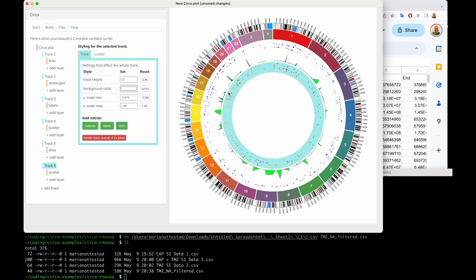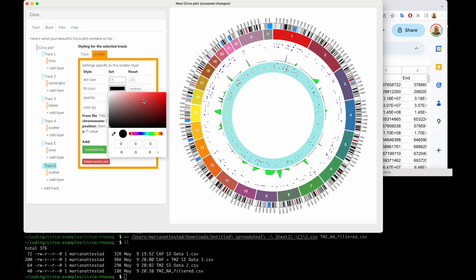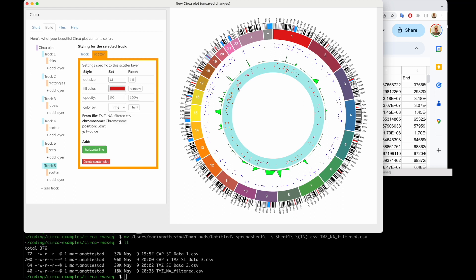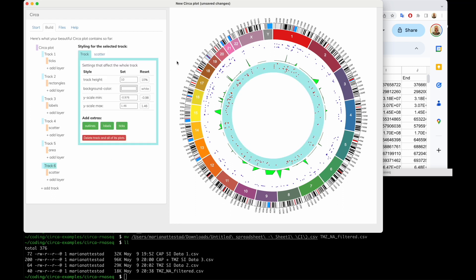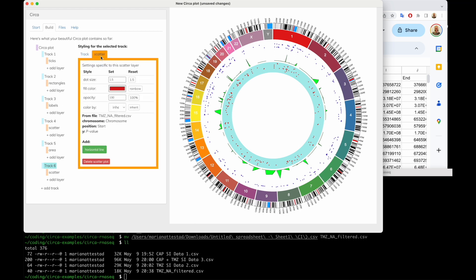This one I can also go and change the color to something I prefer so it's easier to create a legend — like 'this is the TMZ something.' And if you forget what is what, you can go into the scatter settings and see which file it's from and which values you chose for Y. That way you can check afterwards without having to redo it.